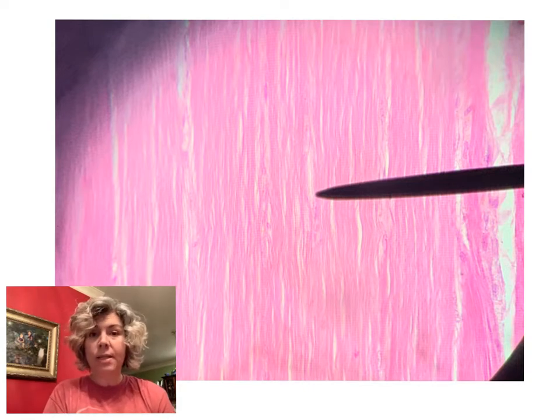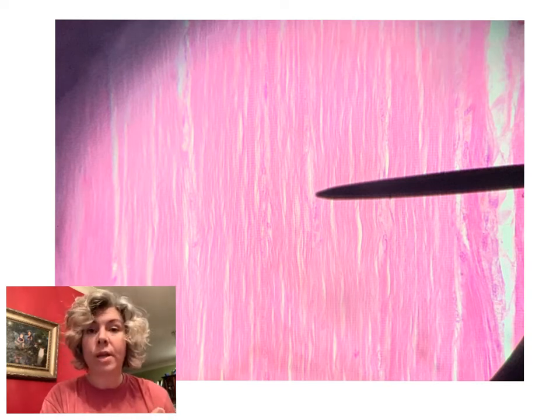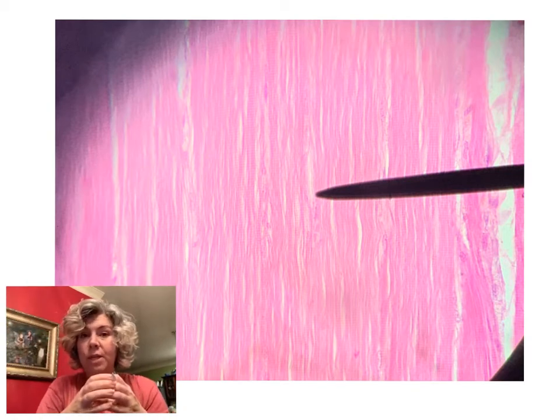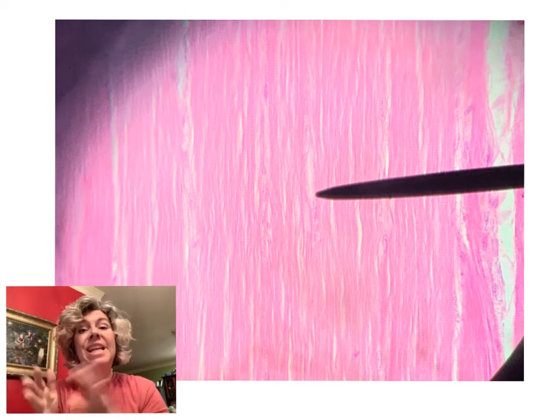For physical appearance, there are a few things you need to look for in recognizing skeletal muscle. First off, the fibers will be parallel with one another. Now, they can run in different directions, but all the fibers will typically be parallel with one another. So here in this photo, you're seeing the fibers running vertically. So you're seeing many pink fibers all in line running vertically. It's possible for them to run transverse. They could run oblique. There's even sphincter muscles that have circular formations. So the direction can be in any direction. But understand that all the fibers will be running parallel with one another.